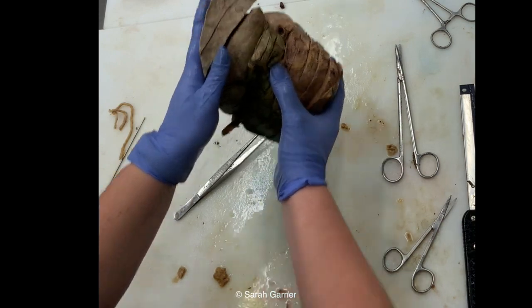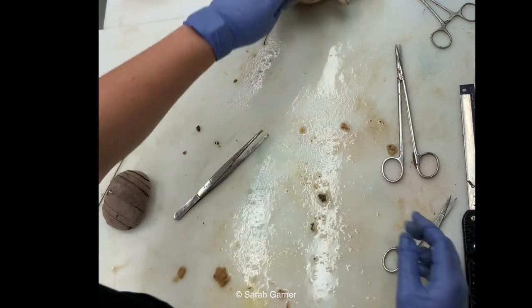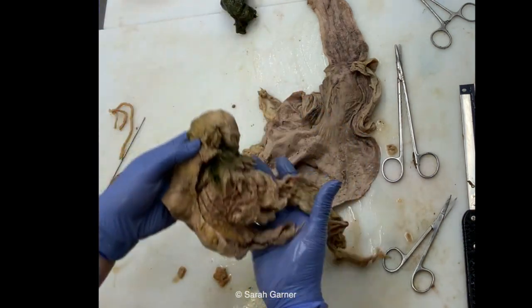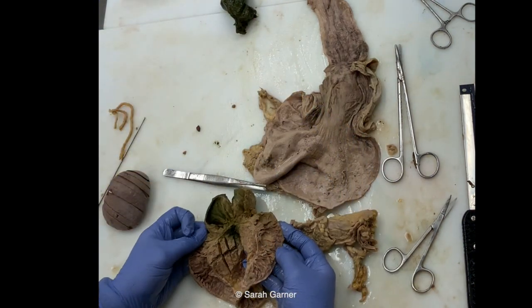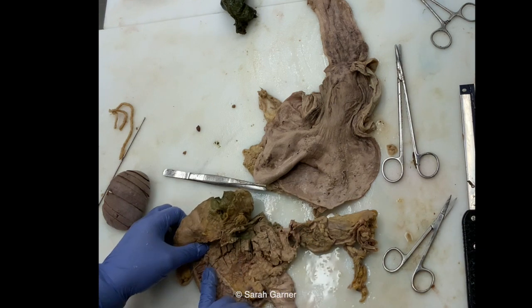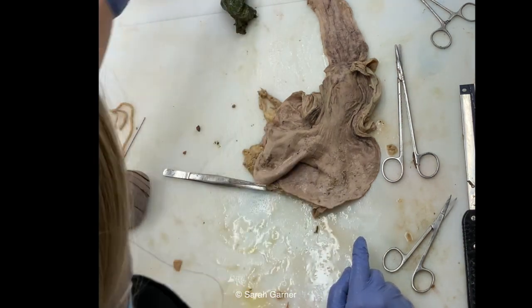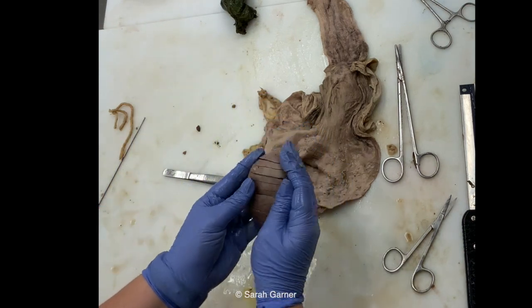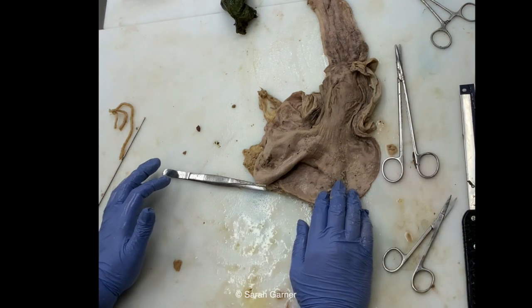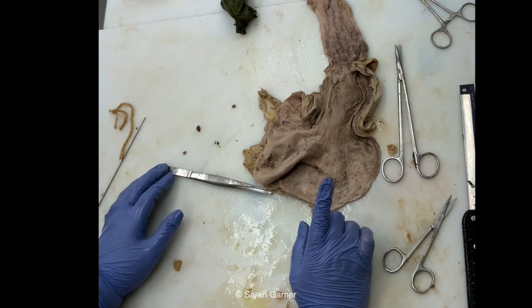And then we went through the rest of the GI tract itself. We opened up the esophagus and the stomach and examined that. We opened up our duodenum with the very end of the stomach here. We bivalved through the ampulla a little bit off, and then serially sectioned through the pancreas and examined that. And then we ended with serially sectioning our spleen. So pretty much everything should be weighed, and you note anything abnormal. And then your sections are going to be institution dependent. So now we'll move on to the thoracic block.